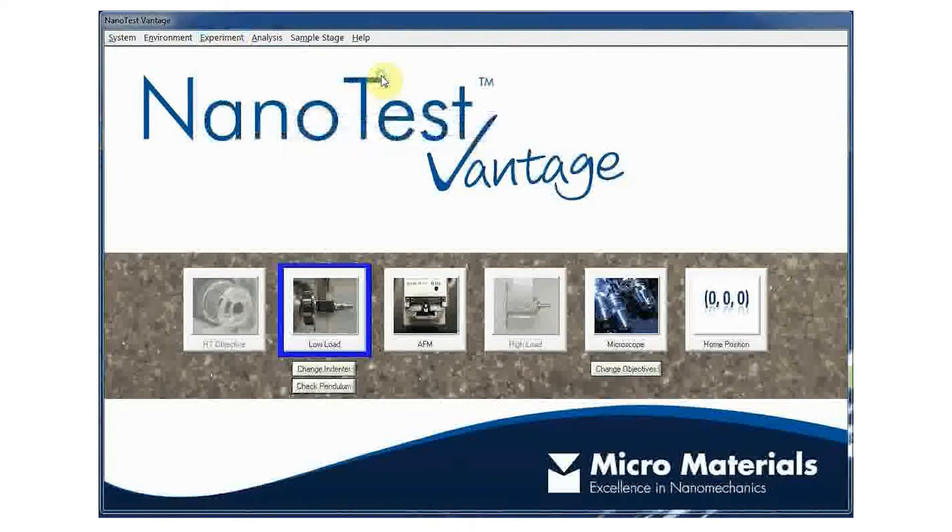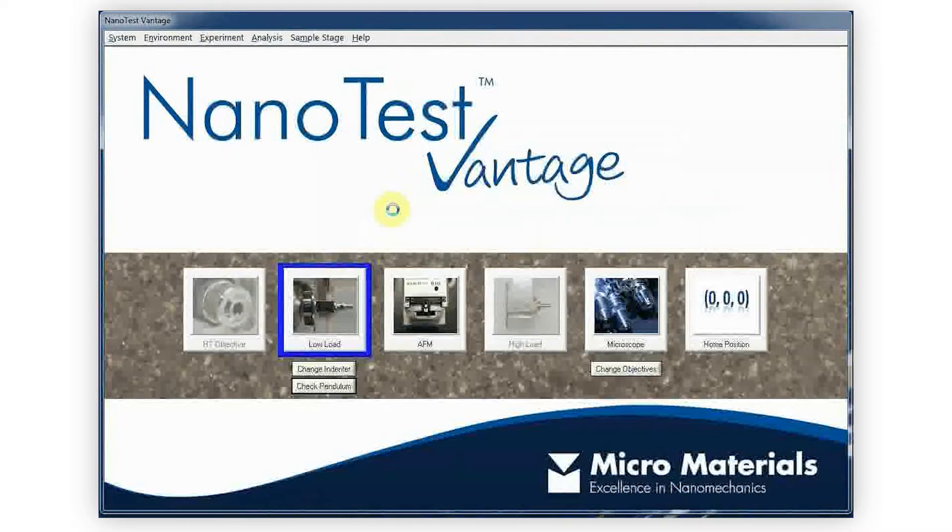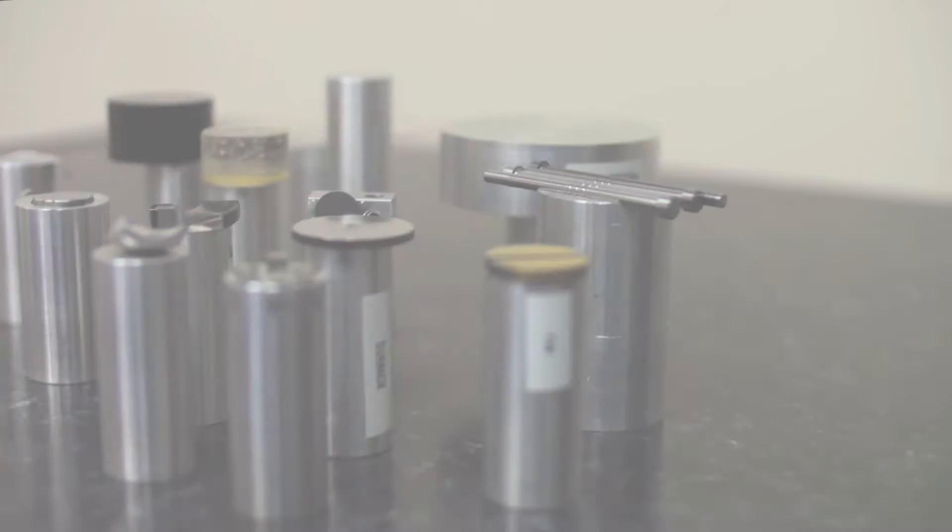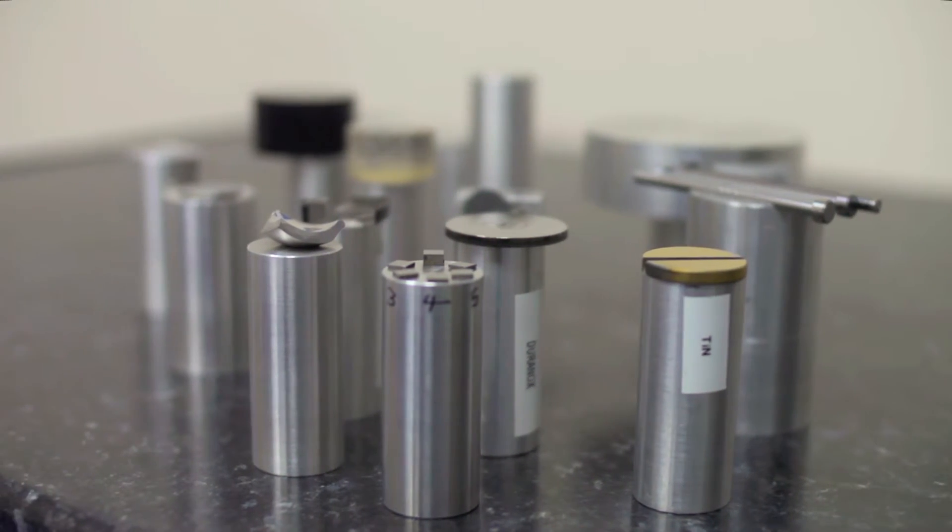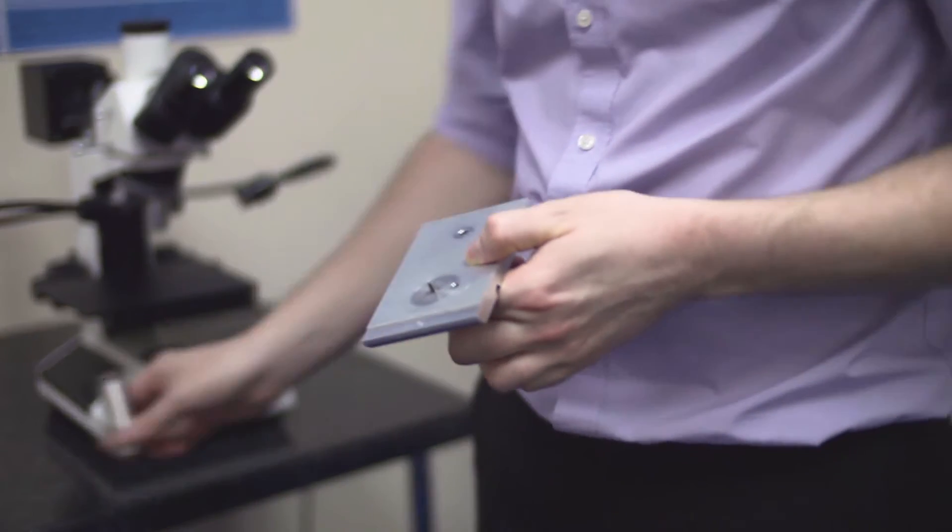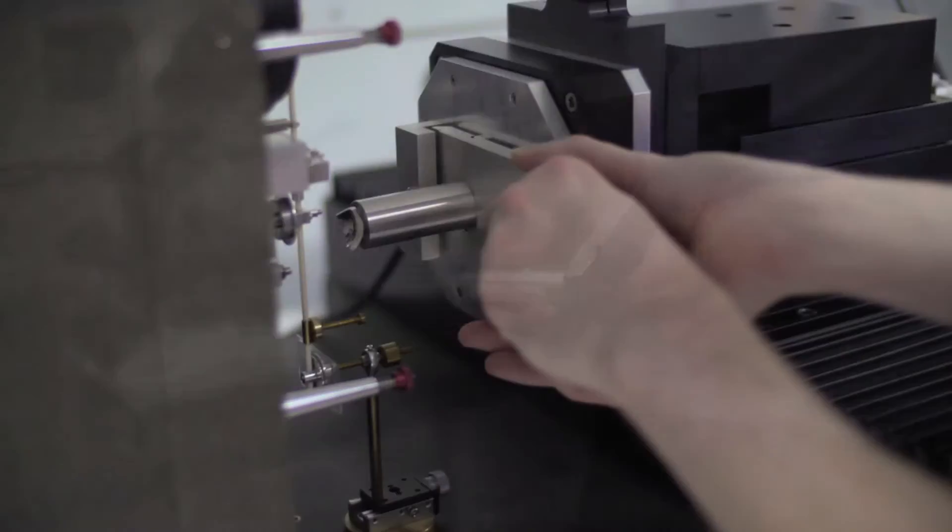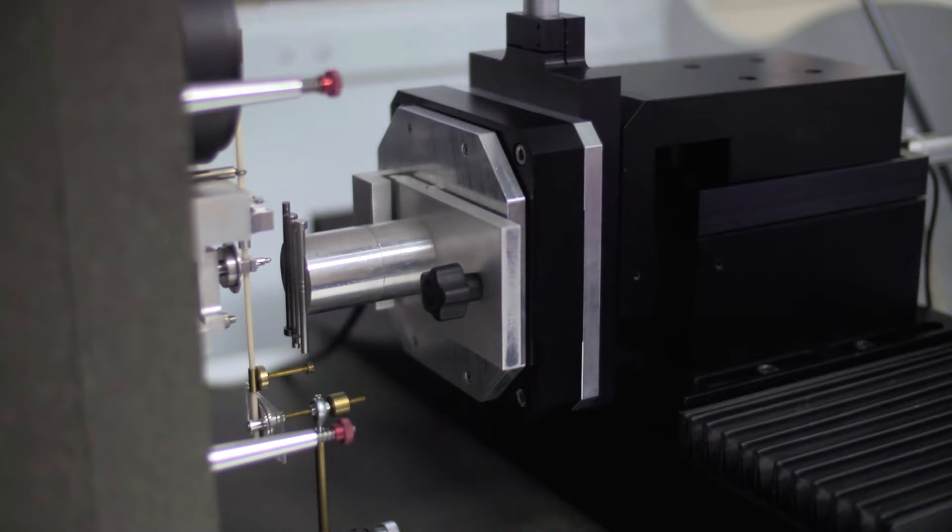In addition, commonly used experimental parameters can be exported and recalled later to save time when setting up schedules. A huge variety of sample shapes and sizes can be tested on the instrument, thanks to its open-platform design. This includes samples that are very large, concave or convex in shape, and samples with high surface roughness.